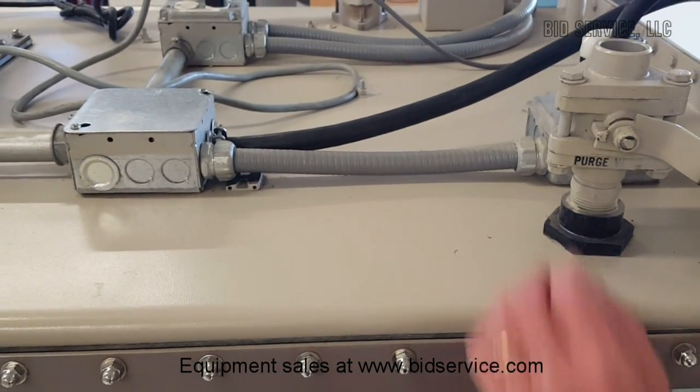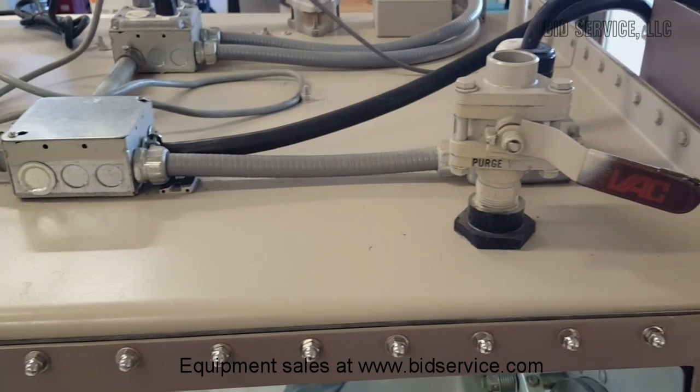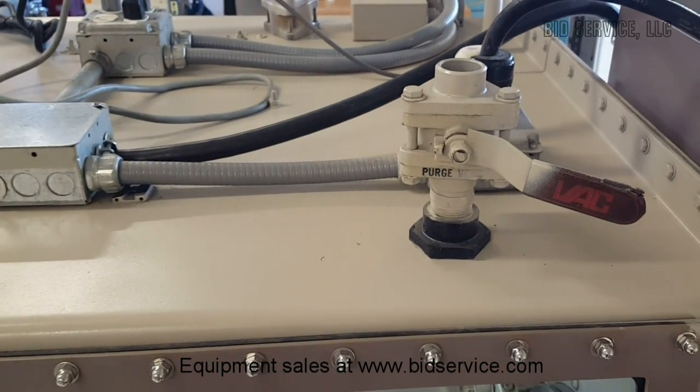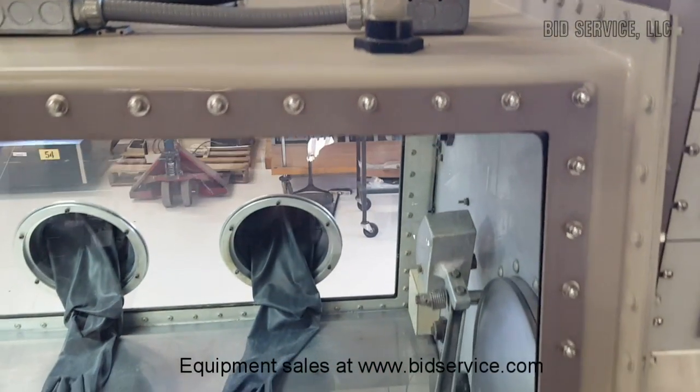This line coming in is 208 three-phase, five-wire, so it has a neutral and a ground. This basically supplies the right side of the system when looking from this side.